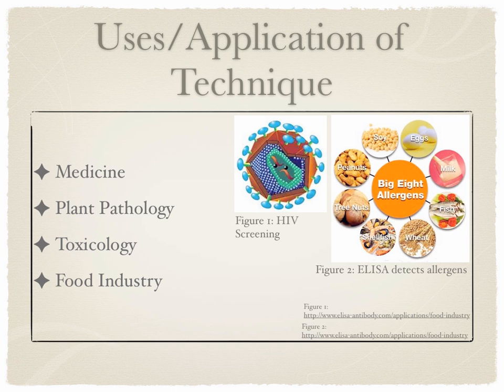Along with PCR, ELISA is one of the most common methods of detecting food allergens, such as to milk, eggs, fish, shellfish, peanuts, wheat, soybeans, and tree nuts. The allergen protein molecule is detected by binding antibodies to the allergen and using a colorimetric change. Sandwich ELISA has been used to detect an antigen to the bacteria Mycobacterium tuberculosis.